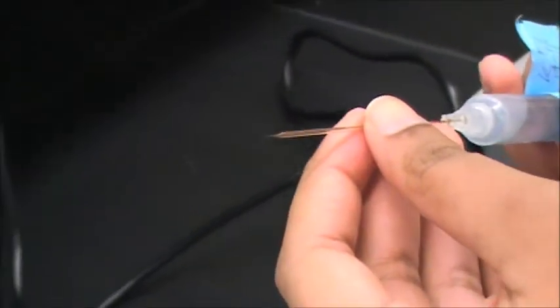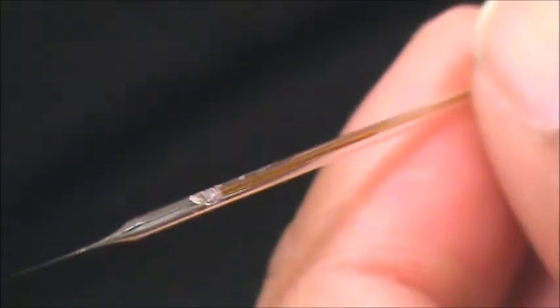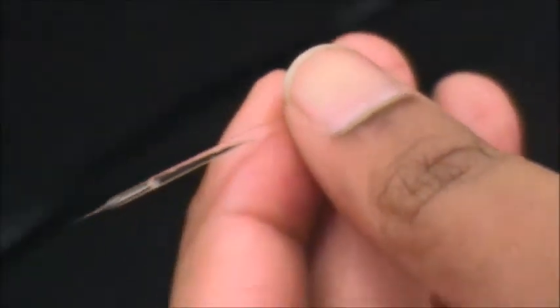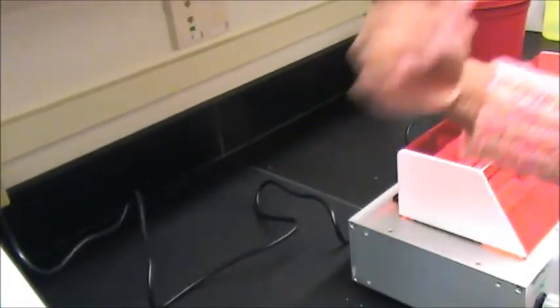So we're going to want to tilt it like this so it can drip from the back. I'm going to slowly fill this up with KCl. Sometimes you're going to get some bubbles, so you can kind of shake it around a little bit.